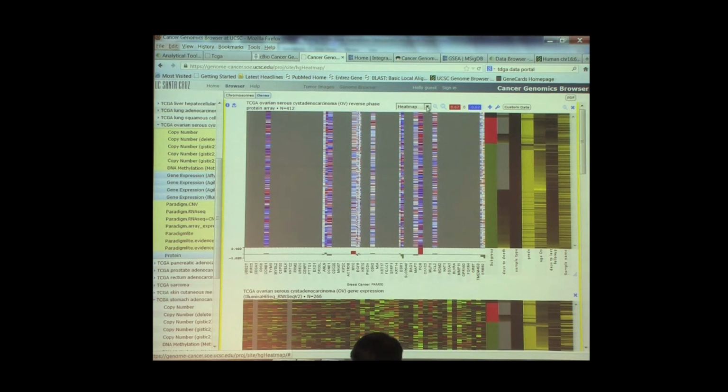Okay? Now we've done the statistics here, and for kicks, let's say we'd actually like to add DNA methylation and copy number, because we'd like to see whether the gene expression for MYC is often amplified. Is MYC being amplified, and is estrogen receptor and lack of expression of estrogen receptor being indicated by methylation?